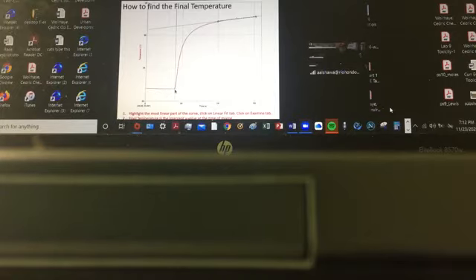The first portion represents the room temperature. The jump indicates the amount of heat delivered to the water by the heated metal. That plateauing means the temperature cannot rise anymore. It'll plateau for a while, and then eventually it's going to start dropping because the wall of that container is not 100% insulated. Whatever that hot material is will cool down, decreasing in temperature after a while, back to room temperature.